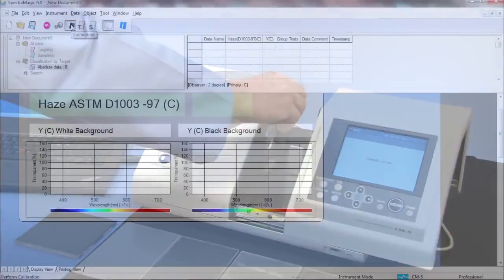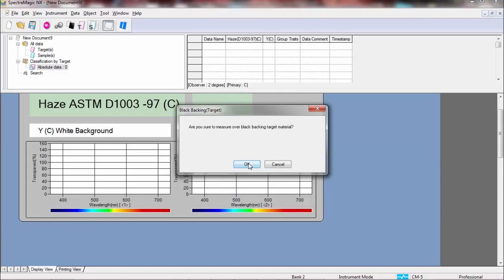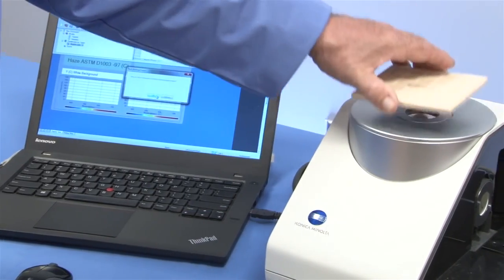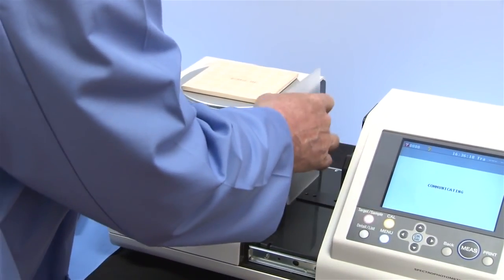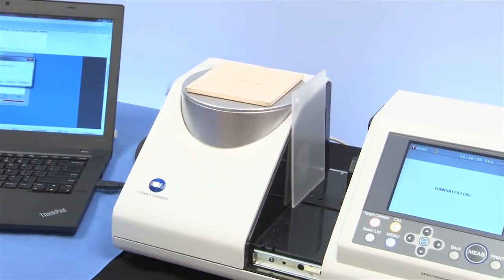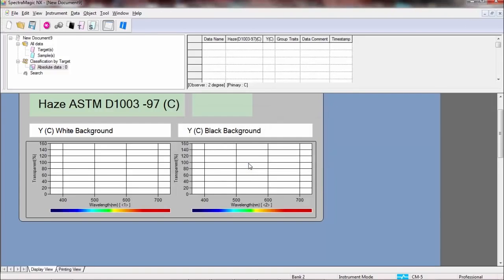This procedure requires a measurement over a contrasting background. When creating a target, you will be prompted to take two measurements for each reading — one over white and the other over black. The reflectance port must be blocked. SpectraMagic NX allows for measurements of haze with the use of a custom template, an important quality control procedure for many industries.